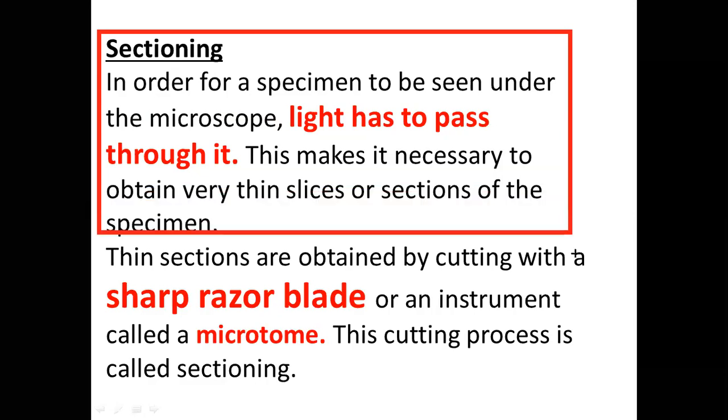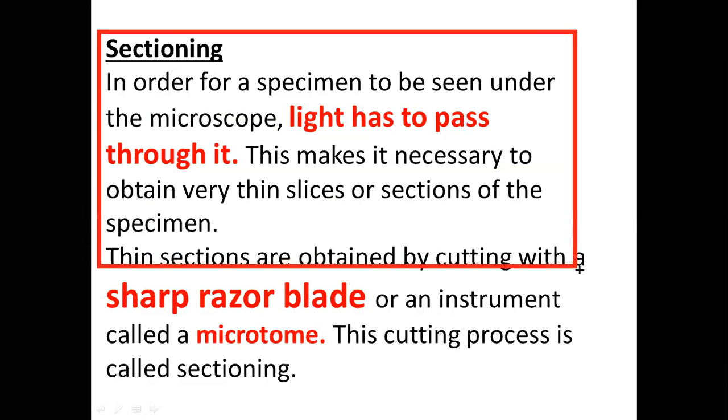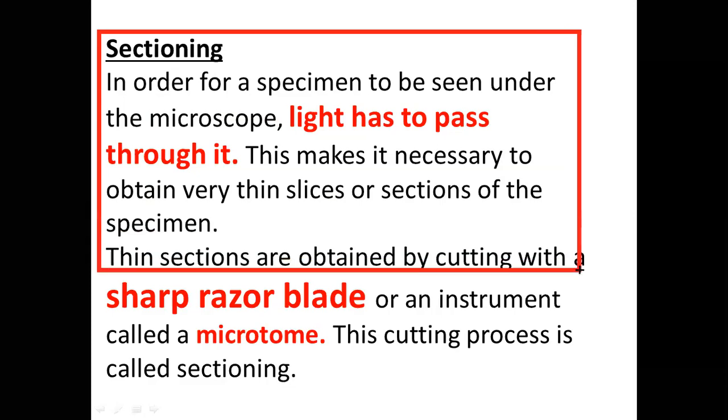of specimen. Now, as we have seen earlier, you can either be told to cut, that is 1997, it was cutting. Sometimes we are peeling, we peel. If you remember what we saw in 1996, we are peeling the epidermis. So an examiner can tell you to cut. Sometimes he tells you to peel. Although it depends. In 2014, we never cut, we never peeled. We will see what we did.